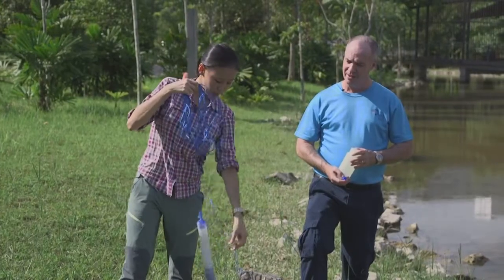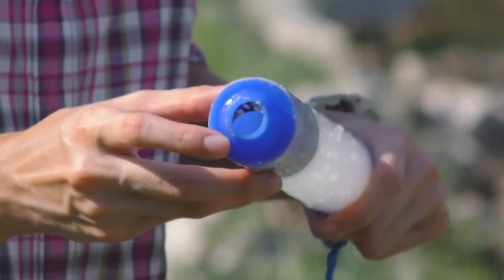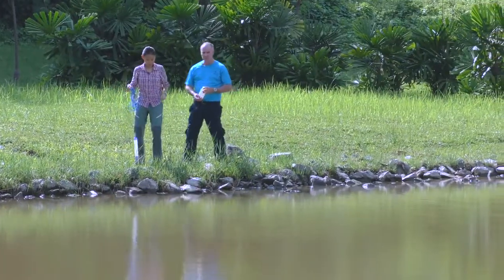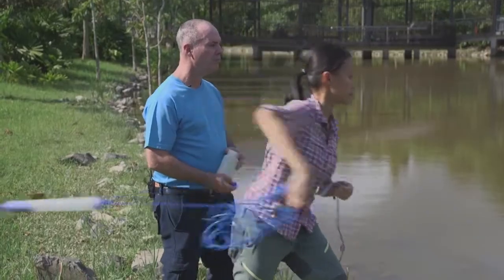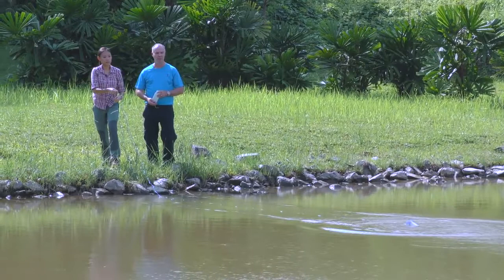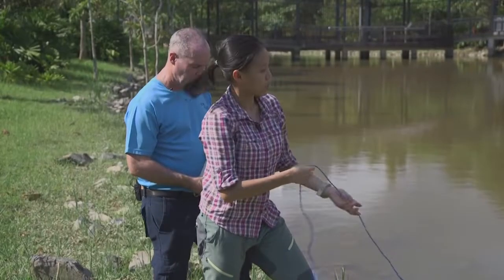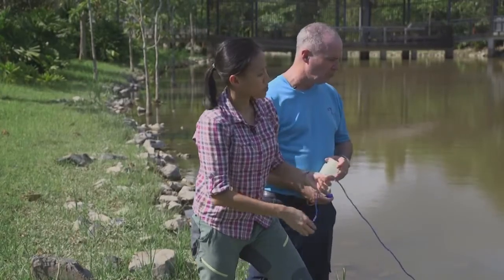An alternative to the dipper is a baler. The advantage of the baler is that we can cast it out further from the shore. The baler has a small stop ball at the bottom that will help to contain the water as it sinks. The baler will sink and collect the water. This means that the sample will be a mixture of water from different depths.